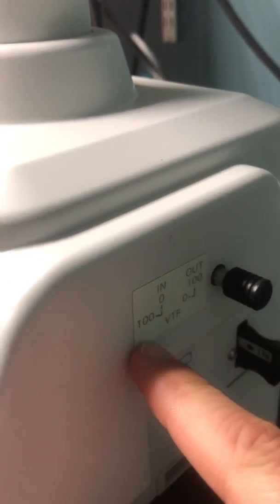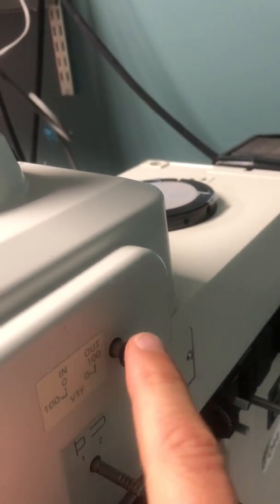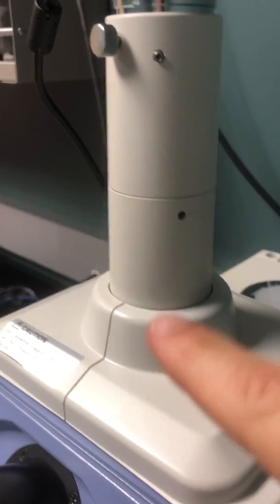So then that brings us back over here. You can see we have this dial here on the top. When this dial is in, you can see that 100% of that light is going to the eye. So it has to be in for you to be able to see your image and get the focus and everything. But when you're ready to take an image, you take this dial up top here and you pull it out, because pulling it out sends all of that light up to the camera. And unfortunately, when I pulled it out, it didn't do anything here. So let's go ahead and try to refresh this.